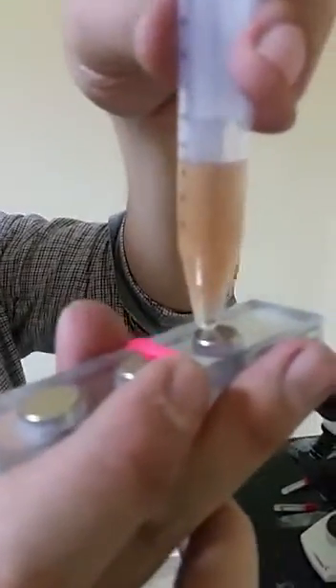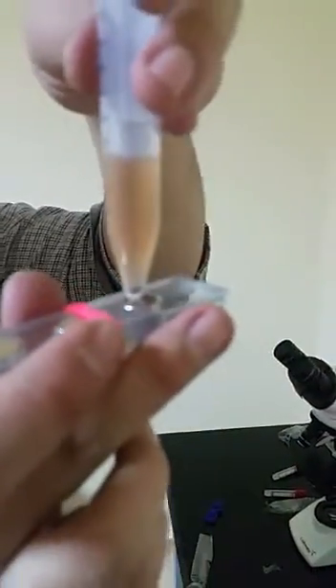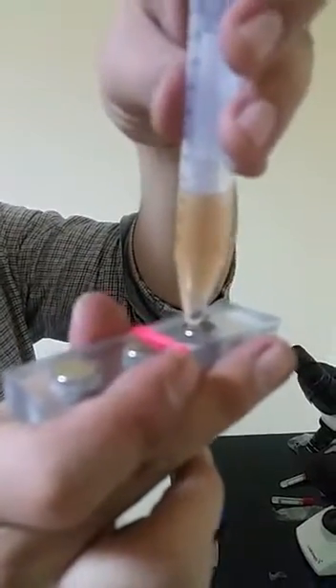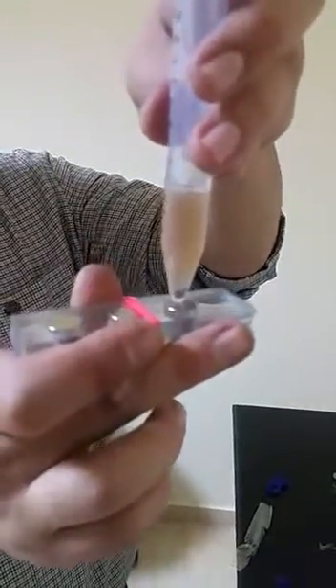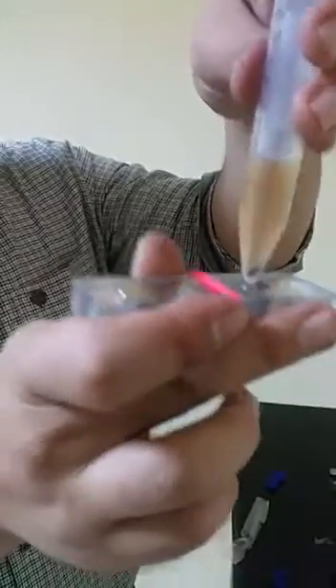These are simply responsive — you just place the magnet like this. See, it's very fast, it doesn't take much time for response. The size of the particles allows very rapid response with the magnet, and our magnets are very strong and capable of 100% complete separation within 10 to 20 minutes.